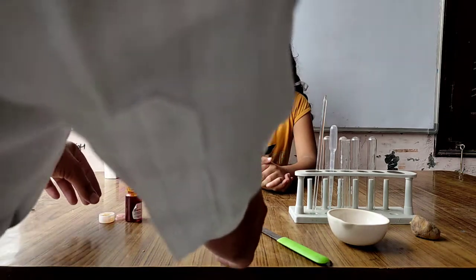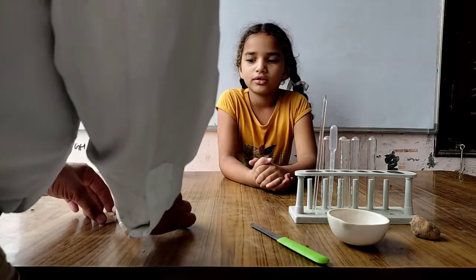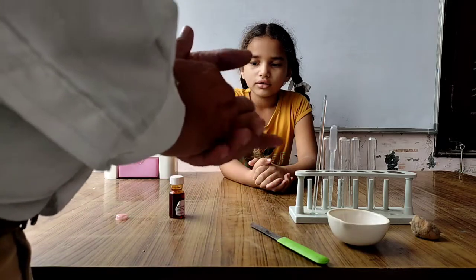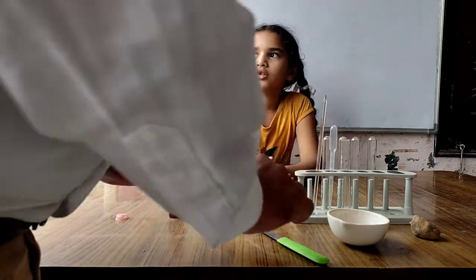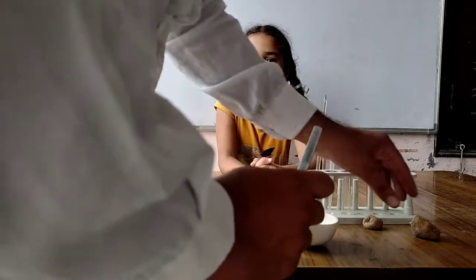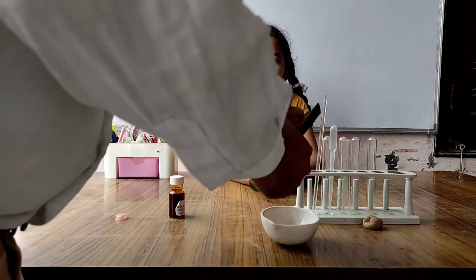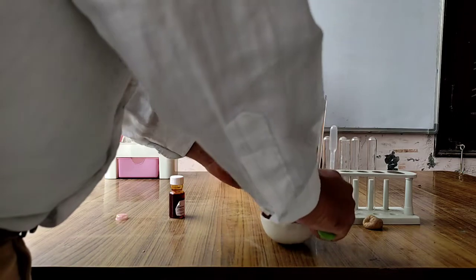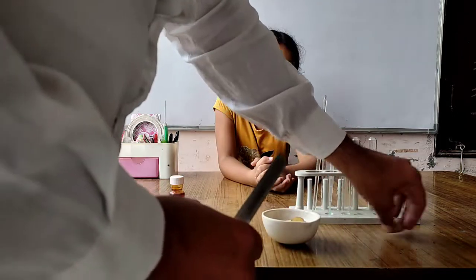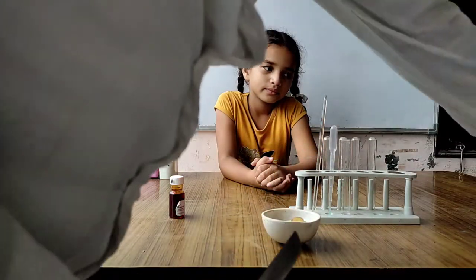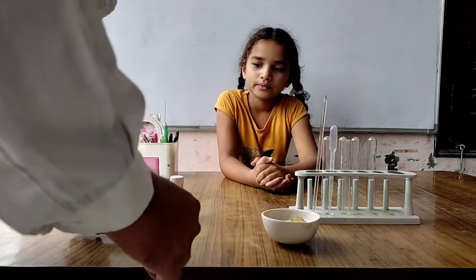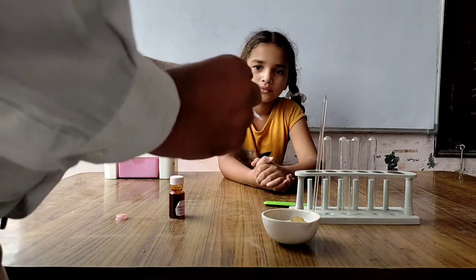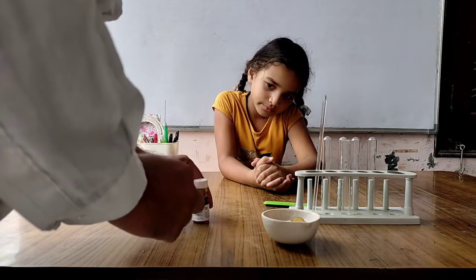Now students, we are performing the experiment to check the starch in the food material. For this, I have potatoes. I have cut the potatoes into two pieces and I have a dropper and iodine solution.